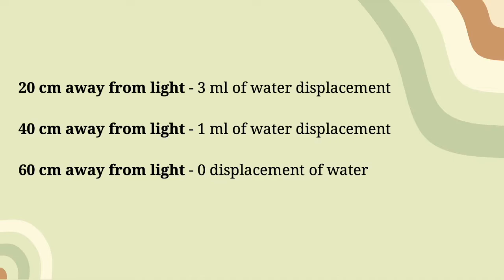These results indicated that as light intensity increased, then the rate of photosynthesis also increased as the volume of water being displaced was greater with the oxygen gas, since a higher energy of light was being lit towards the plant. Therefore, more oxygen was produced and more carbon dioxide was being used, until the carbon dioxide usage had reached its light saturation point, which caused the rate of photosynthesis to become constant due to a limited number of rubisco enzymes that were needed to allow for photosynthesis to occur.